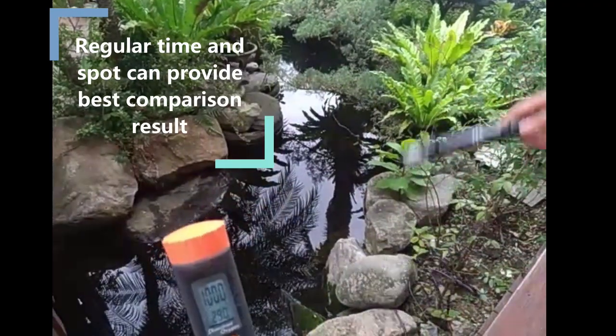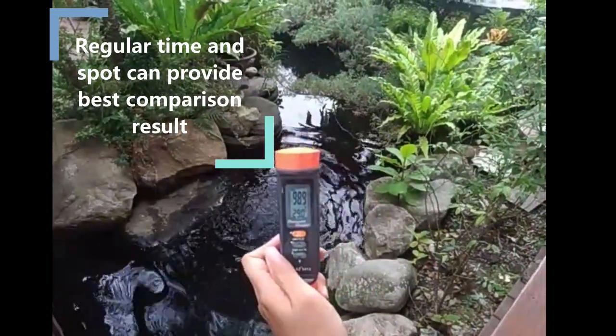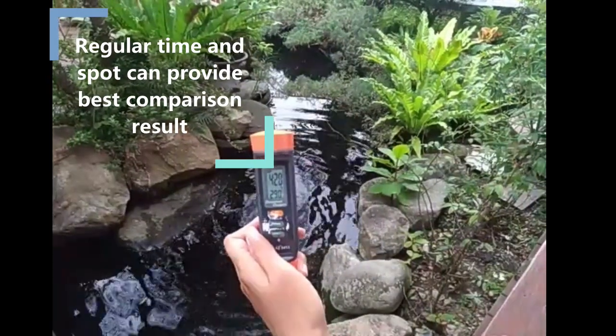After completing the calibration, put the probe into the water. Measuring at regular time and spot can give you the best daily comparison result.